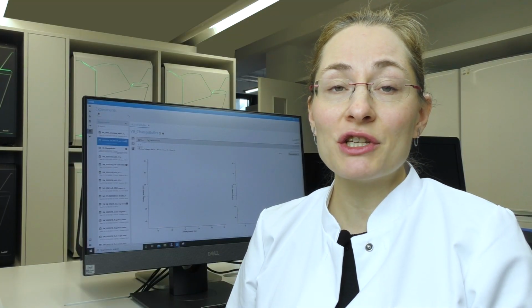Once the assay is running, we can see the data collection during a measurement in real time in heliX. All data recorded is automatically saved to the database and is ready for analysis when the assay has finished. This tutorial measurement finishes after just 21 minutes.